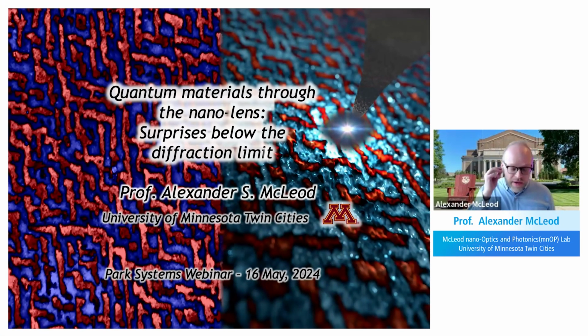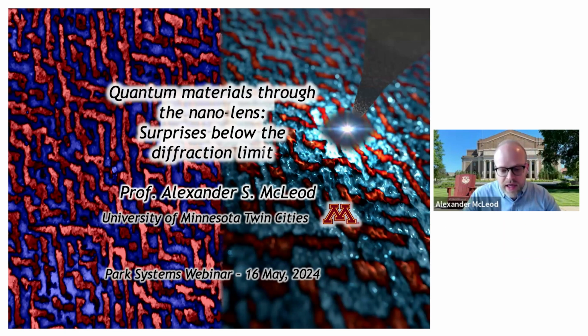What I'm going to present to you today is how to use what has been for years a more or less conventional scanning probe technique, atomic force microscopy, and put a spin on it. The spin we're putting on this technique is to couple it to light and use the atomic force microscope as a tool to bypass the diffraction limit, which normally impedes our ability to see things with light in conventional microscopy. Use the atomic force microscope as a tool to circumvent the diffraction limit.